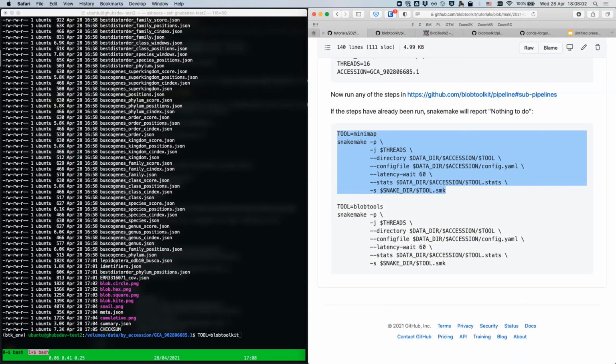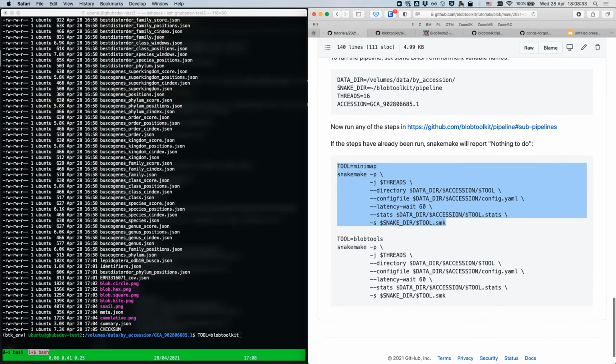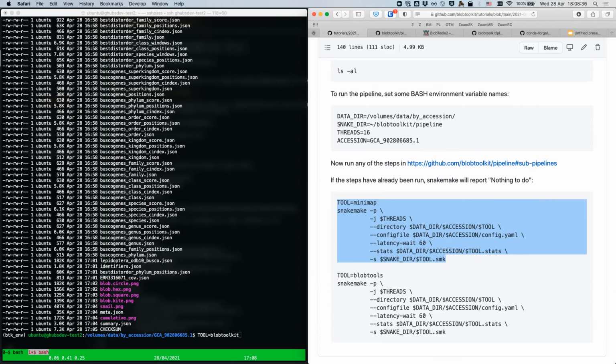I had another question regarding the new pipeline. I haven't had a chance to test it out, but the first version of the pipeline always attempted to pull the databases and format them, meaning the pipeline required internet access. If you're running this on a cluster, it always choked and broke because the compute nodes generally don't have internet access. That was one of the things I struggled with the most, fighting with the pipeline, and eventually I abandoned it. I understand. Is version 2 able to be run offline more easily?